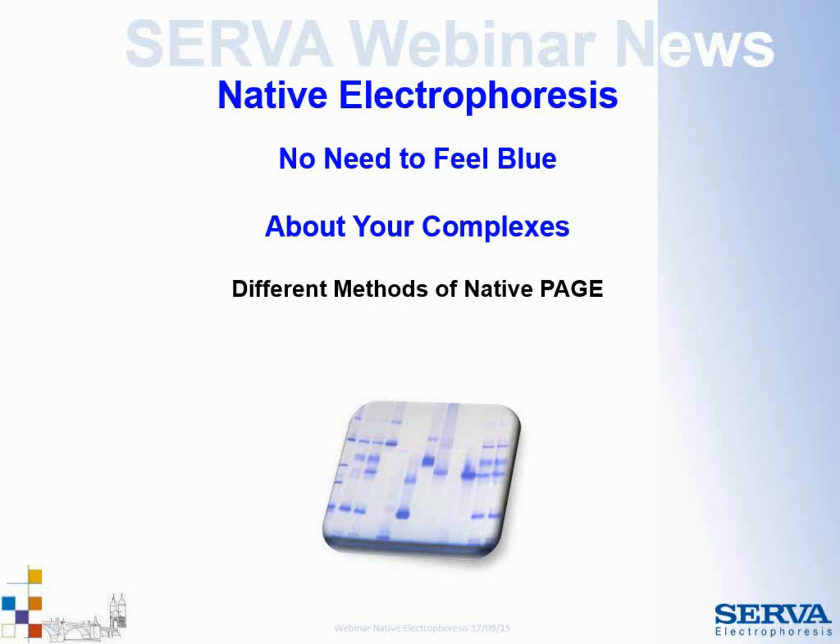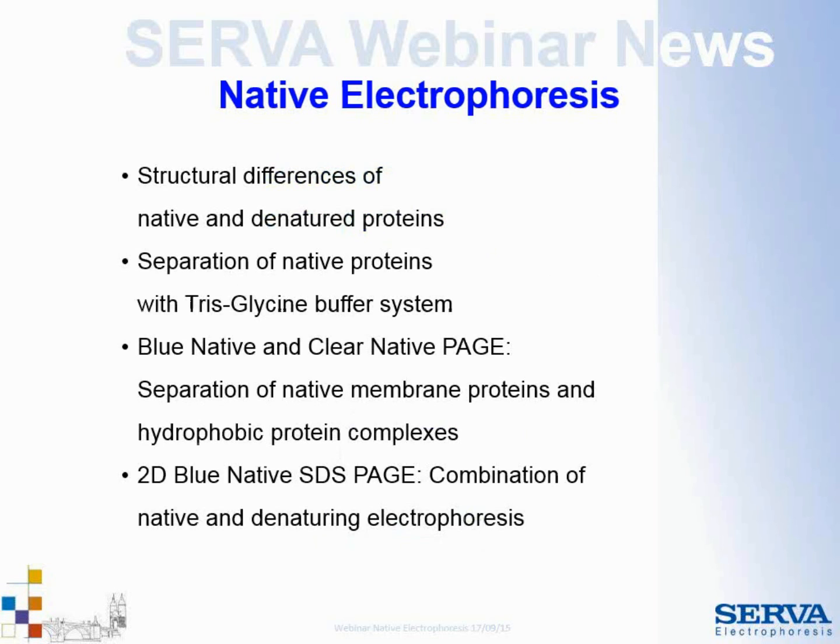Today in this webinar, I will talk about the different methods of native PAGE. First of all, I want to give you an overview of the structural differences of native and denatured proteins. Then I will switch to the separation of native proteins with a Tris-Glycine buffer system.